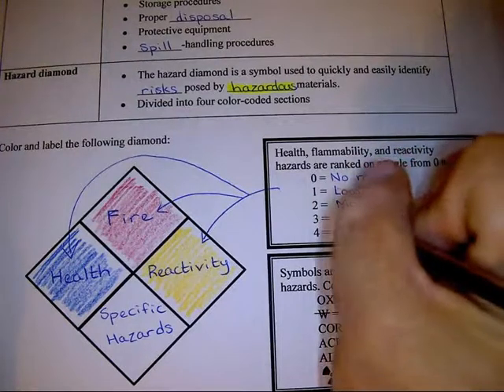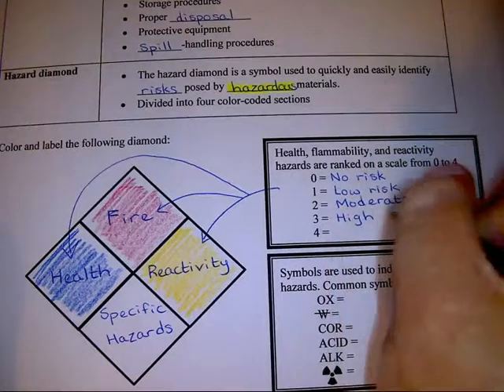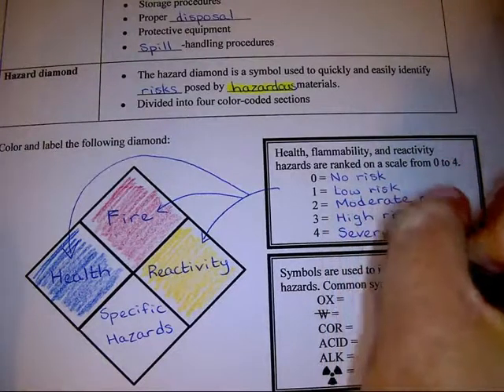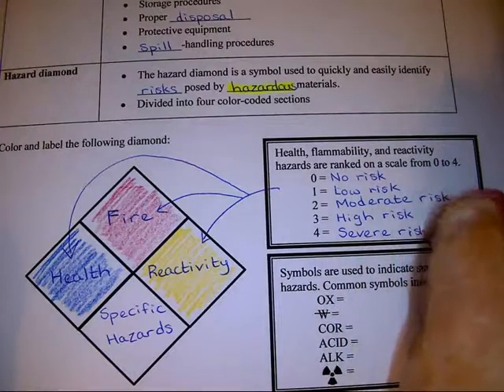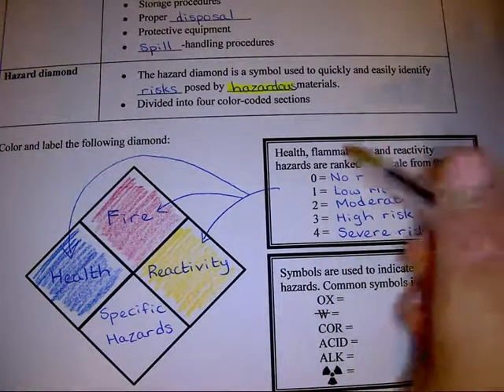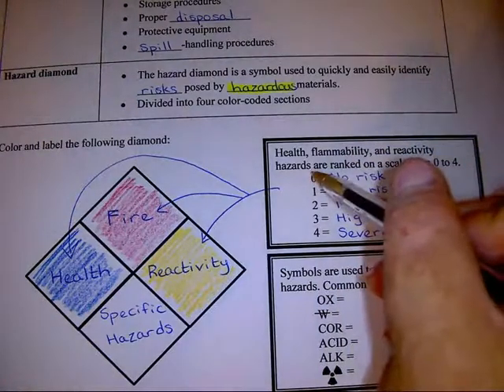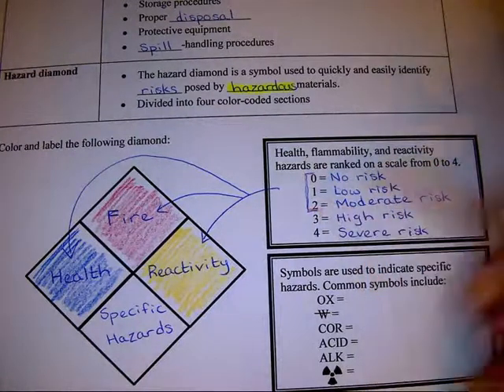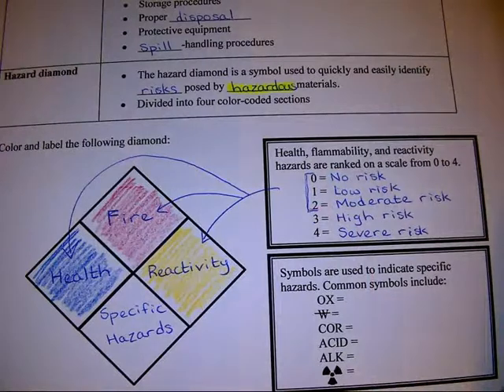If there's a 3, that's a pretty high risk. And if there's a 4, it's severe risk. Most of the chemicals that we will use in the lab will be ranked pretty much in the 0 to 2 range, nothing more than 2.